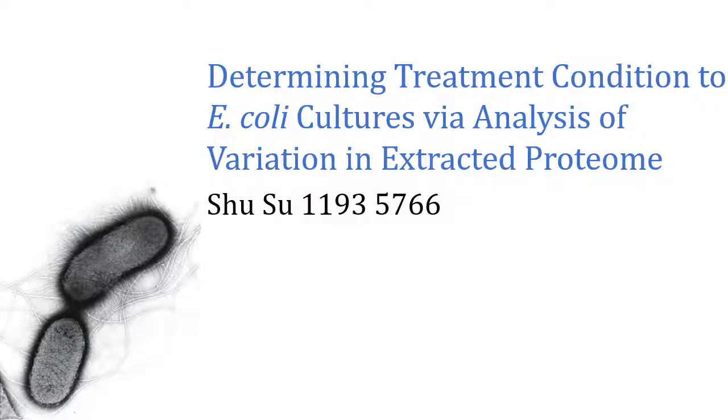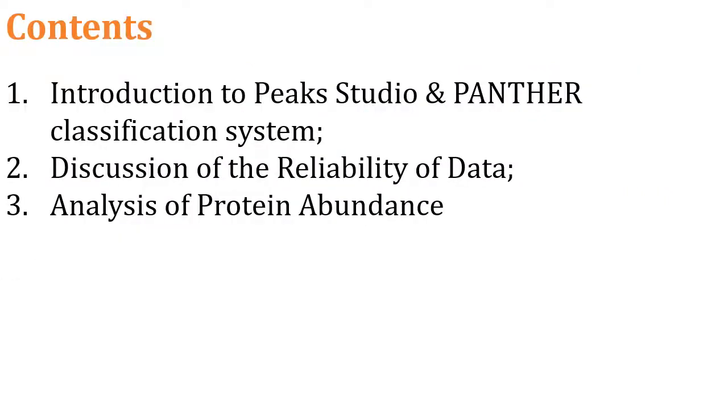In this video, I will illustrate the methods I utilized to determine the treatment condition to E. coli cultures via analysis of variation in extracted proteome. These are the contents of the video.